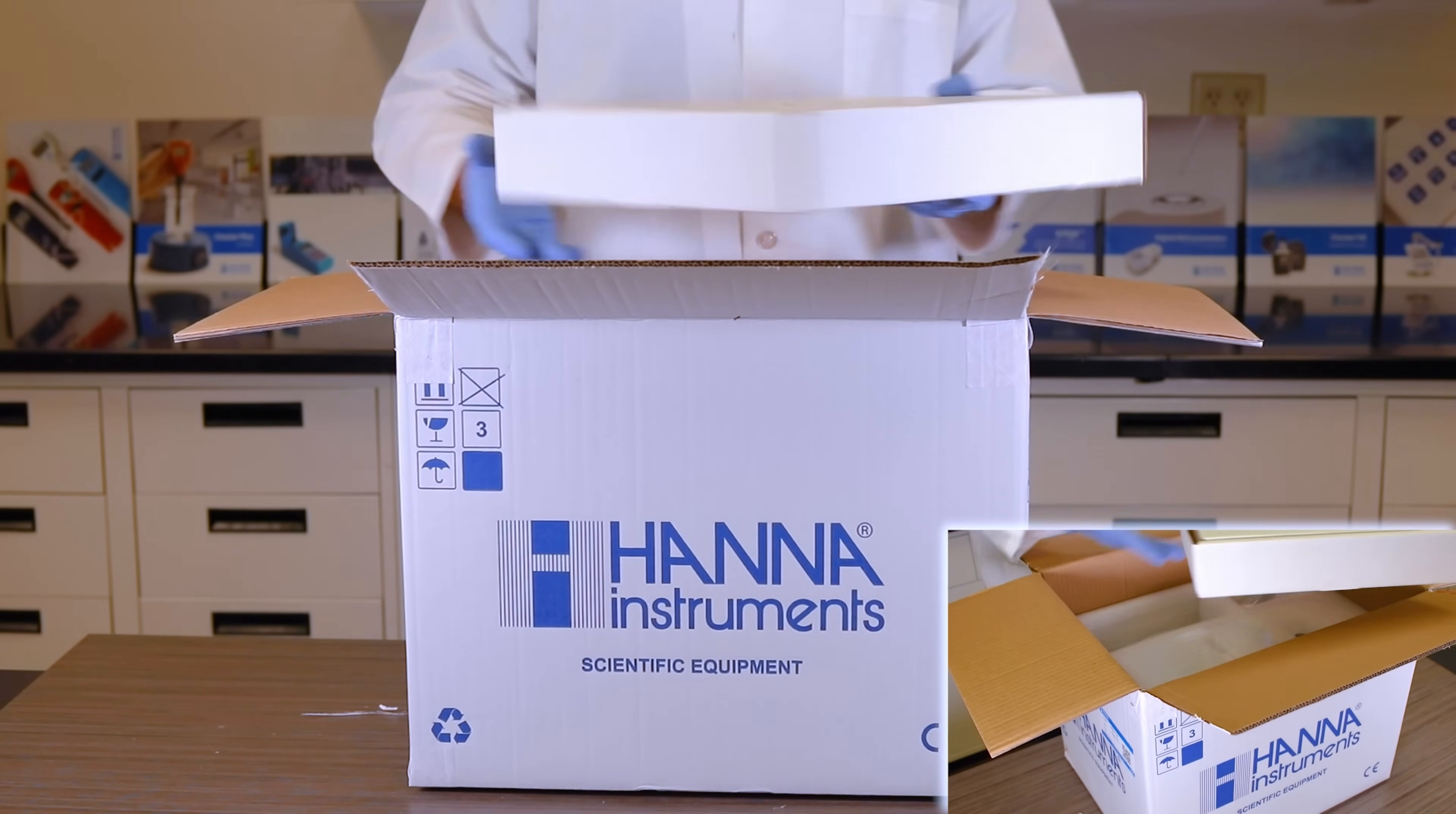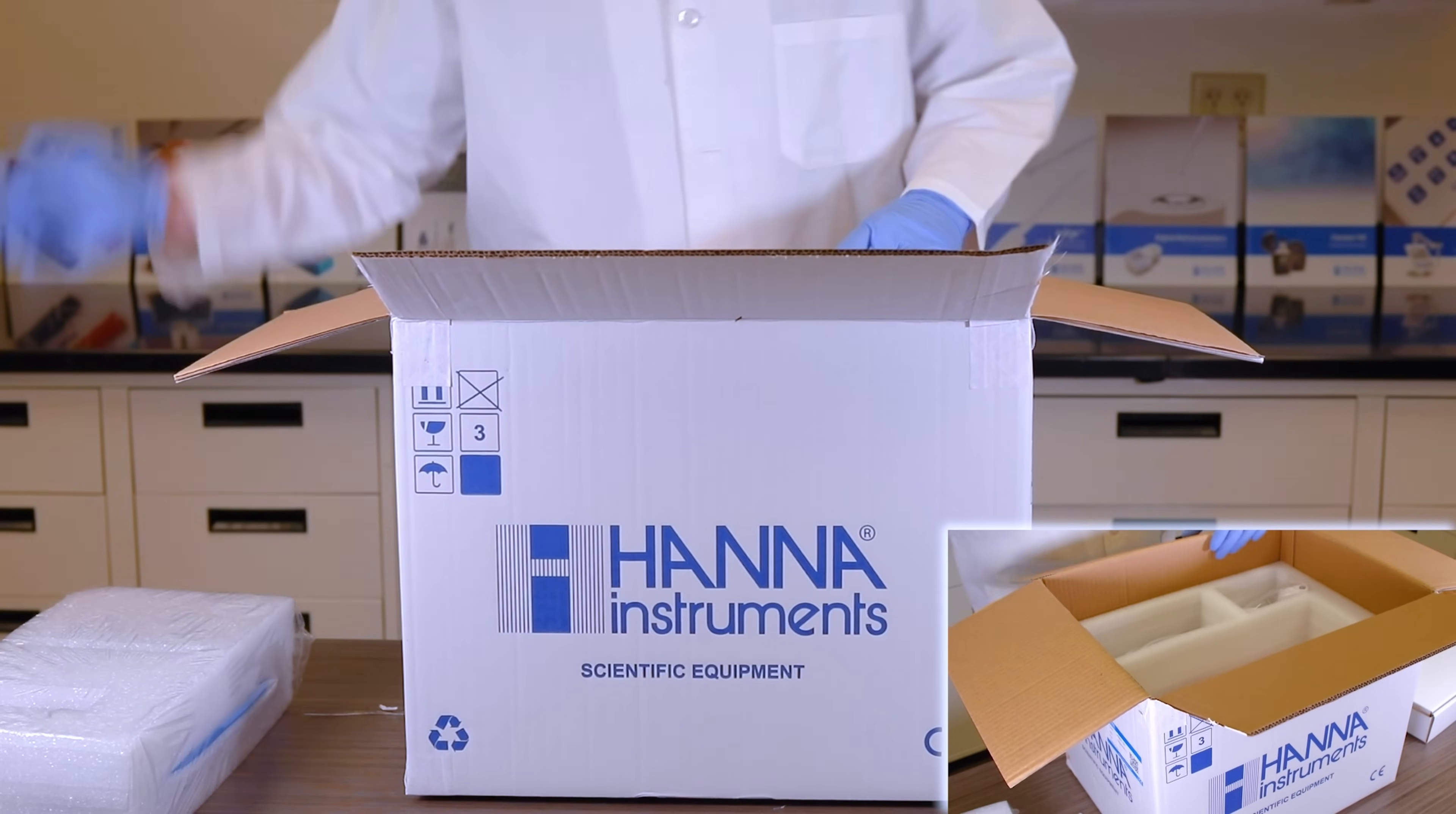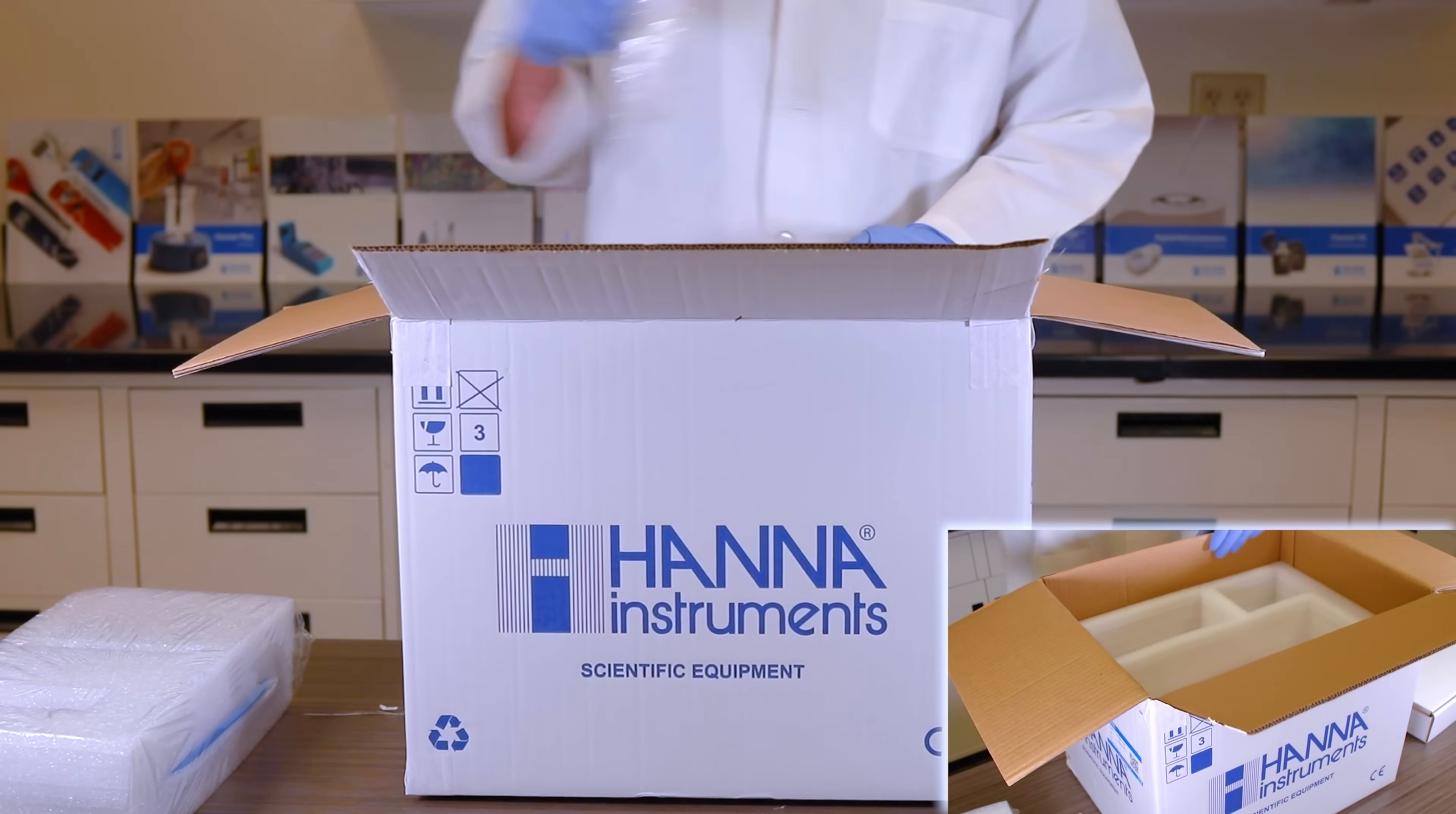Upon opening the box, you will see molded packing foam protecting your titrator. Please unpack all equipment and lay it out on a flat surface to make finding each part easy.